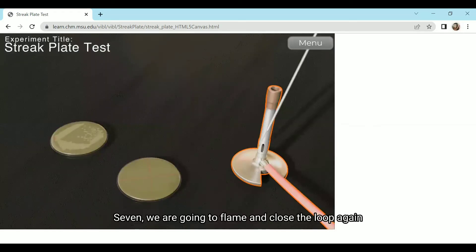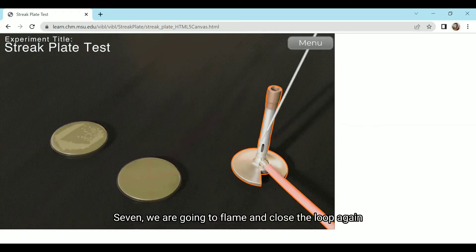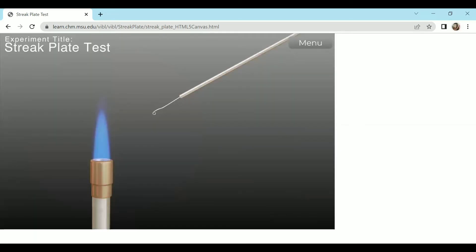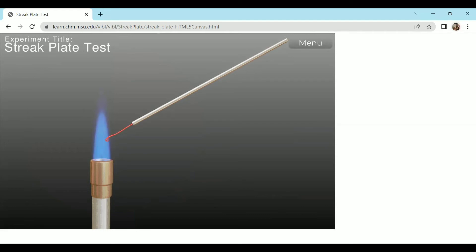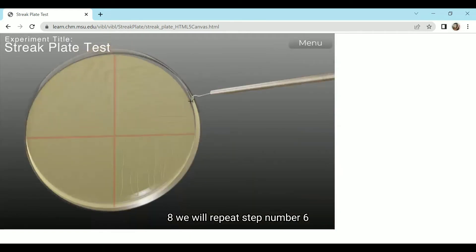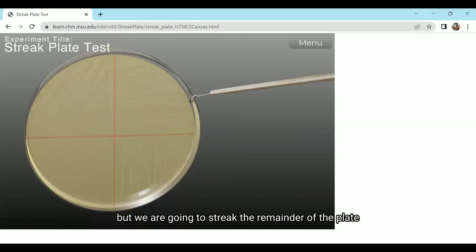Seventh, we are going to flame and cool the loop again. Eighth, we will repeat step number six but we are going to streak the remainder of the plate.